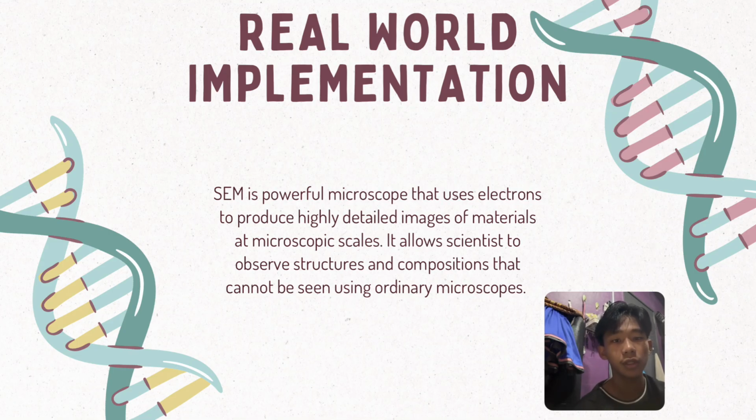This capability allows scientists and engineers to observe intricate structures and chemical composition at a microscopic scale that are completely invisible under ordinary light microscopes.